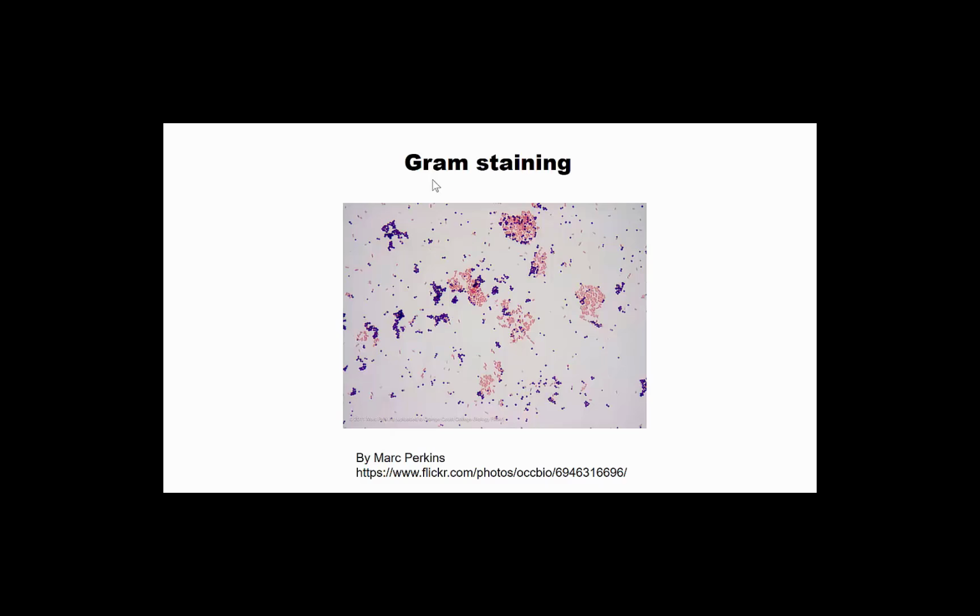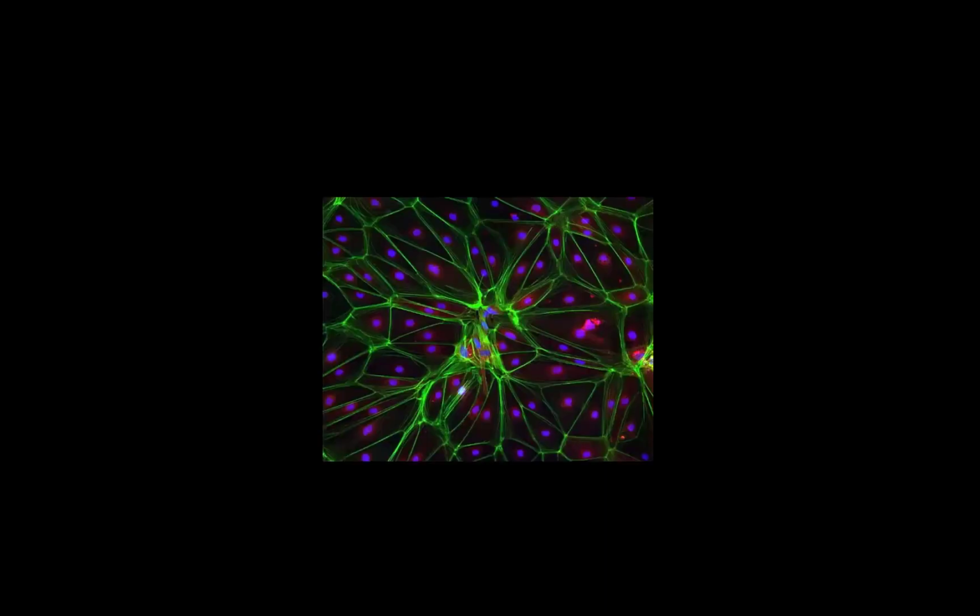Another important point here is, can you see the background of these images? The image background is a white color. That means this image is based on subtractive colors. How about this image? All of a sudden, the whole background is dark. This image is a fluorescent image. Because of this dark background, fluorescence images usually have low background problems and high sensitivity.